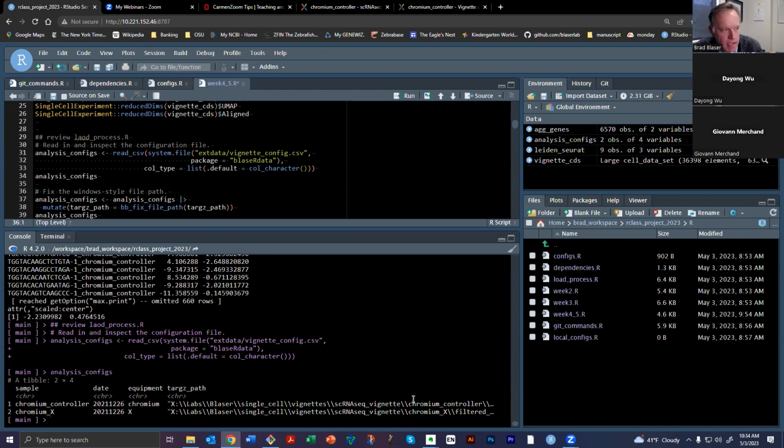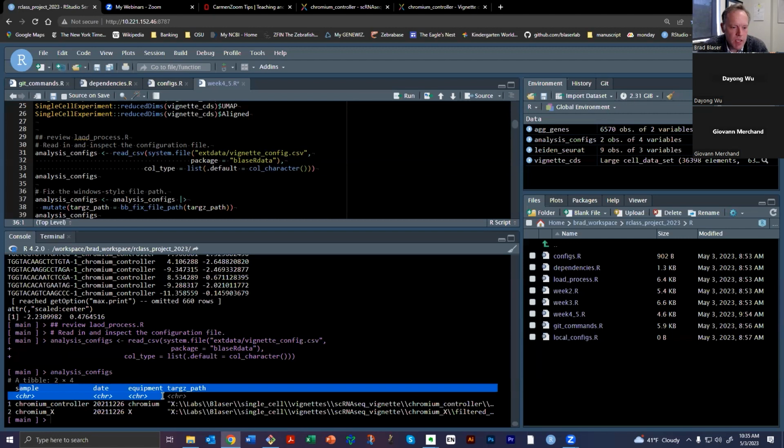Okay, so what's the point of this data set? Well, this is essentially a very small data set that 10X has made available for us to compare a similar sample run on two different machines. So it doesn't matter what it is. We're just going to use this as an example. Okay, so that's all we know. But if you're running, say, a patient sample or a set of patient samples, there's potentially a lot of information that you could put in here, and frankly, it's easier to include it initially than to go in and add it after the fact. So any sample information I'm going to be putting in upfront like this.